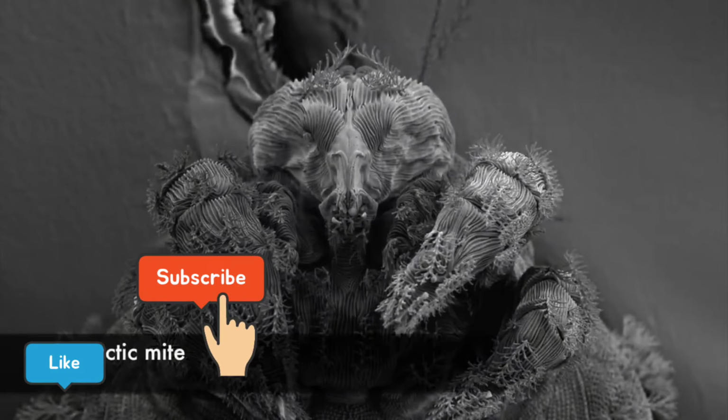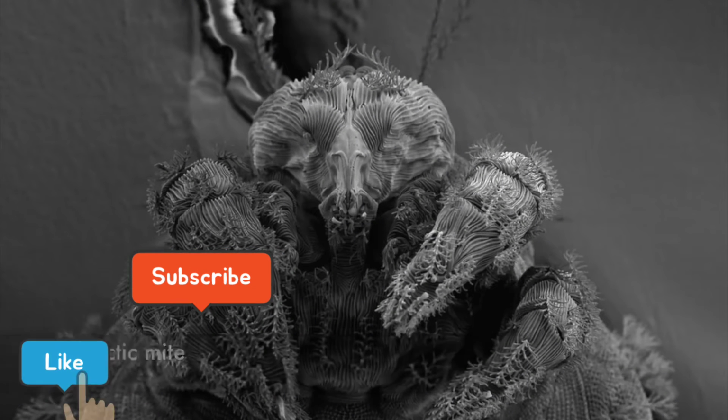These mites were found in mosses and lichen at the Stillwell Hills near Mawson Station in Antarctica. The image is magnified 1100 times.